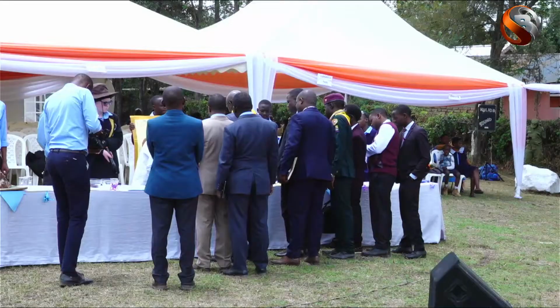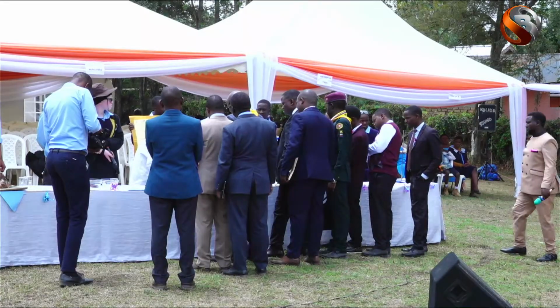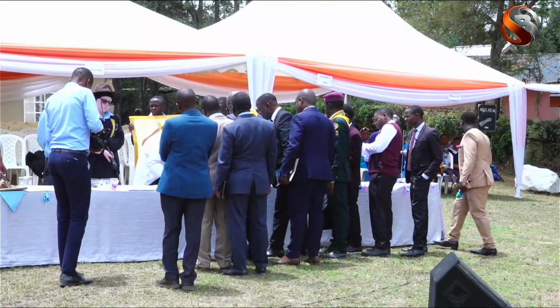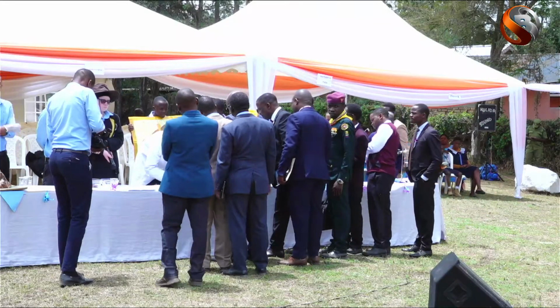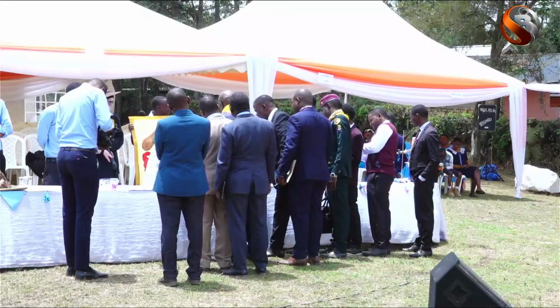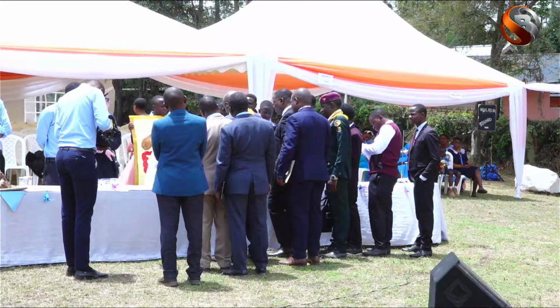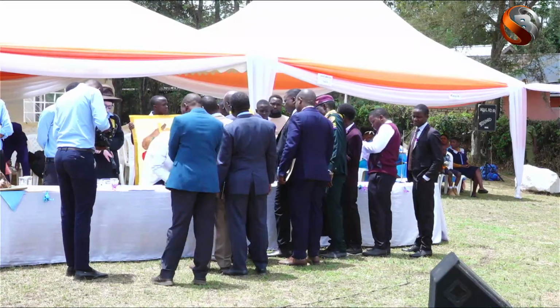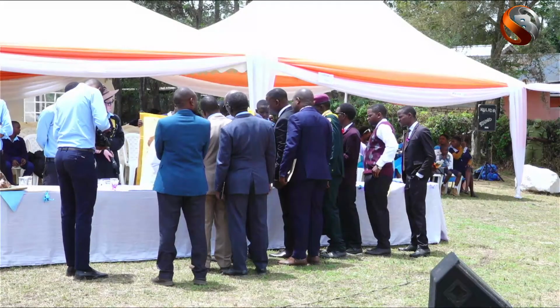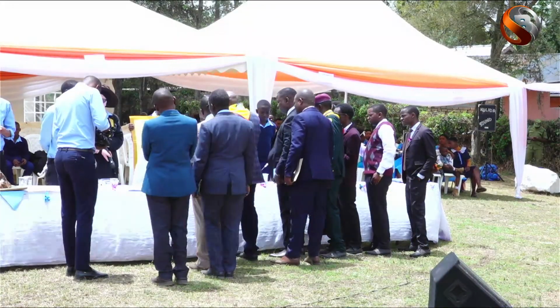But what is the aim of this dissection process? The aim is to bring together the theoretical knowledge which you are studying in class and the practical work which you are doing here now. We also have applications of it. In education, we learn organism taxonomy, and in medical training, we use this organism to study diseases and also growth stages. Now, my friend has finished dissecting this rat, and he is going to show us the organs which are found here.